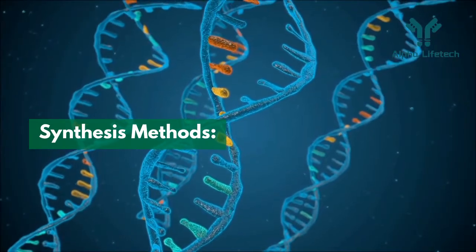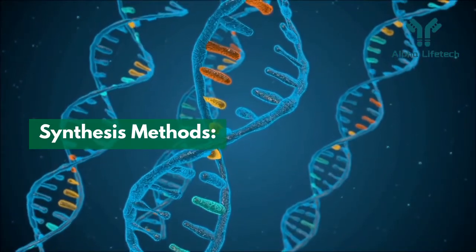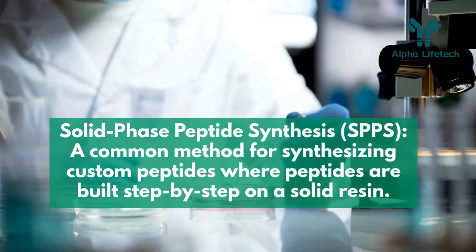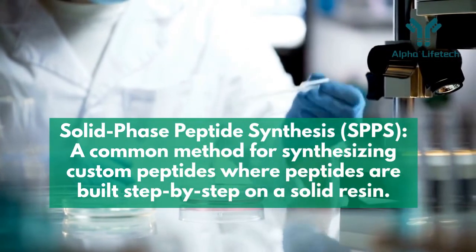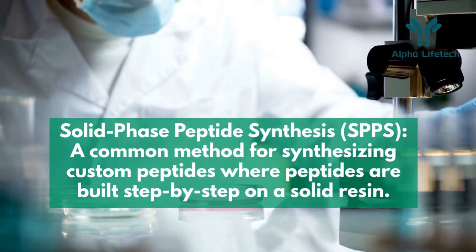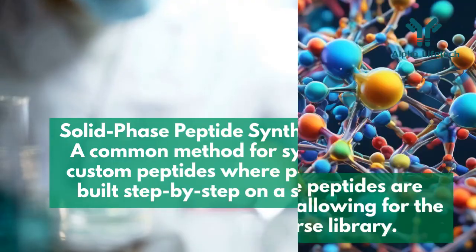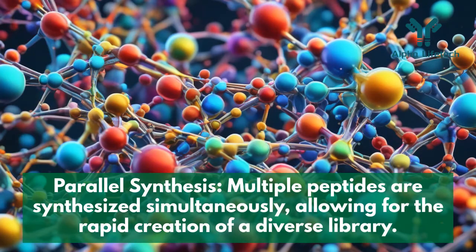Synthesis methods. Solid-phase peptide synthesis, SPPS, a common method for synthesizing custom peptides where peptides are built step by step on a solid resin. Parallel synthesis. Multiple peptides are synthesized simultaneously, allowing for the rapid creation of a diverse library.